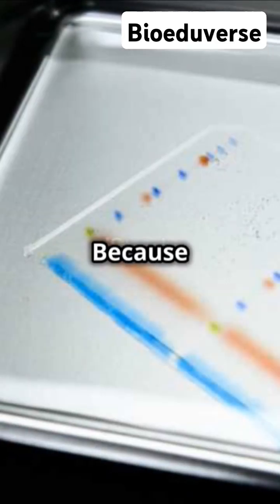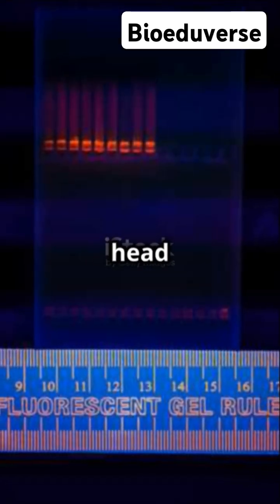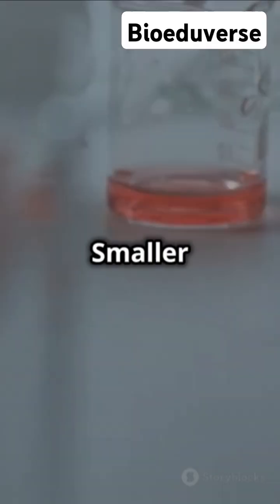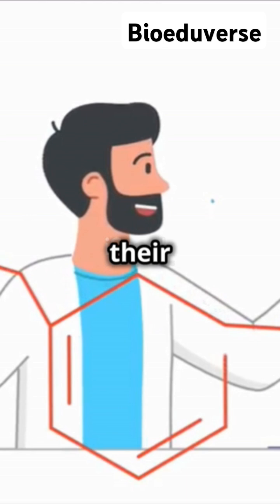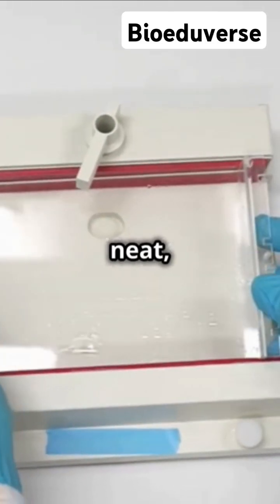The gel acts like a sieve — smaller molecules zoom through quickly while larger ones take their sweet time. This separation gives us a neat, readable pattern.